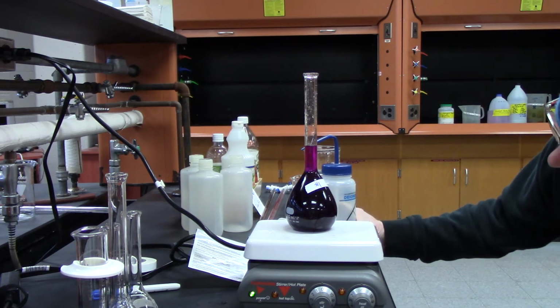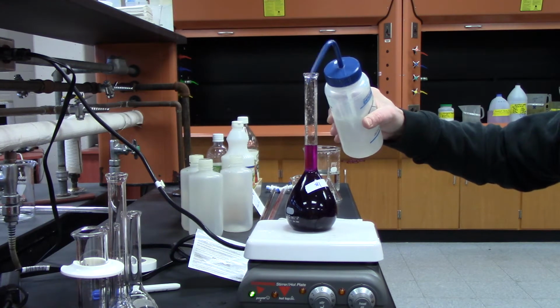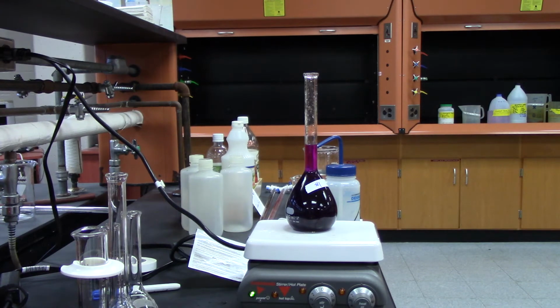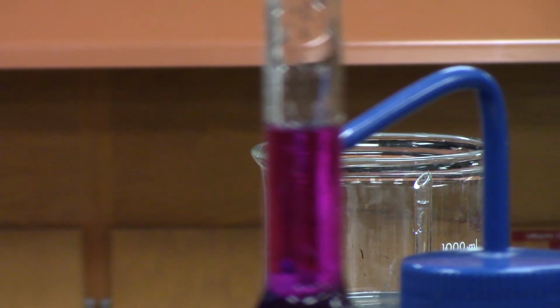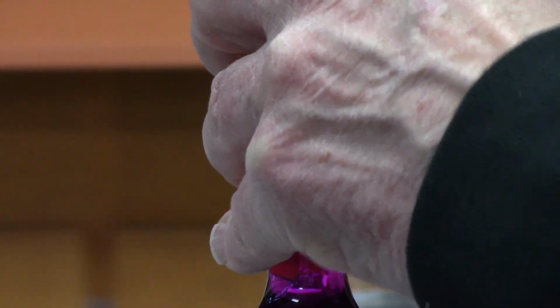Okay. I go a little bit more. All right. Okay, so I got it up to the line. Next thing I need to do is mix it. It's fairly well mixed already, but I put a top on it.